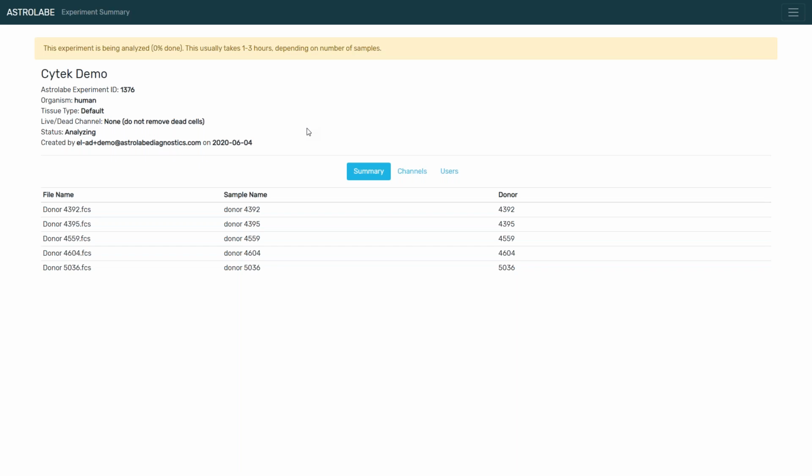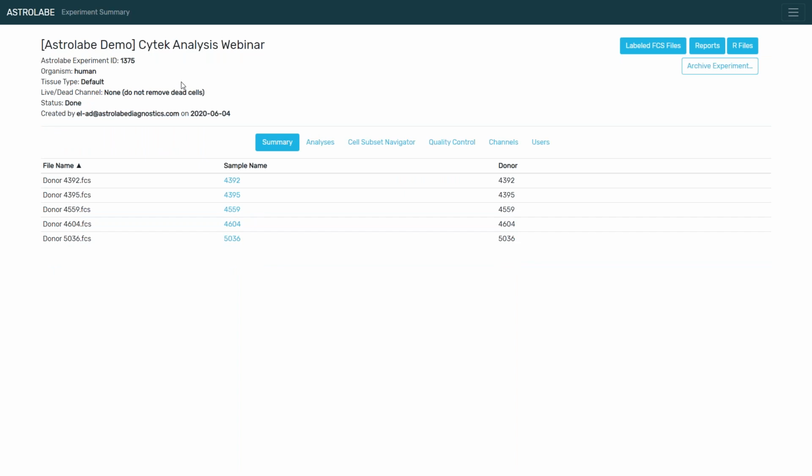For these 5 samples, the analysis is going to take about 20 minutes. So instead of waiting, I'm actually going to fast forward to an experiment that I've analyzed earlier today. And I just uploaded this morning in preparation for today's seminar. So to clarify, to get from your FCS files to here, you do literally everything I've just shown you. Just upload the files and set up the experiment design.